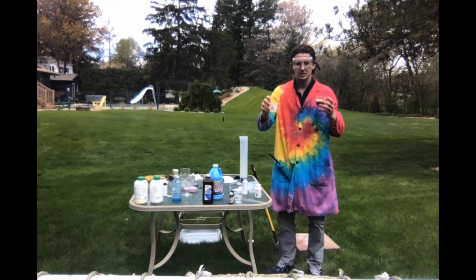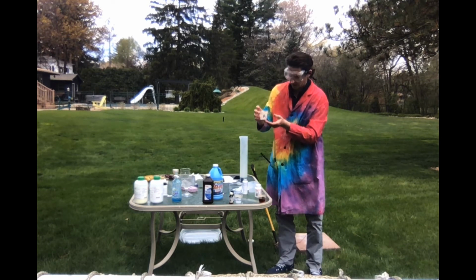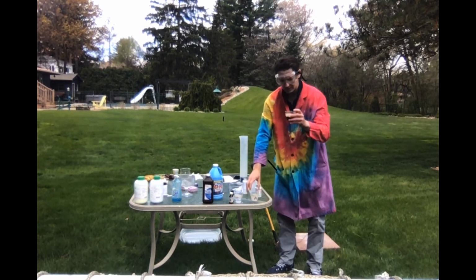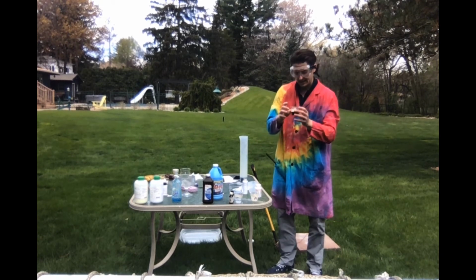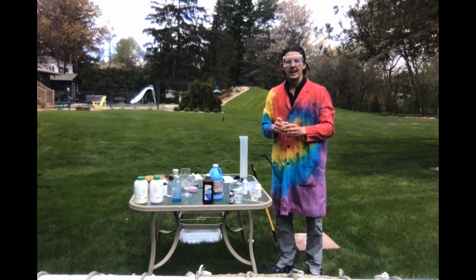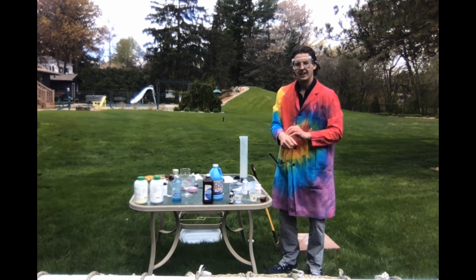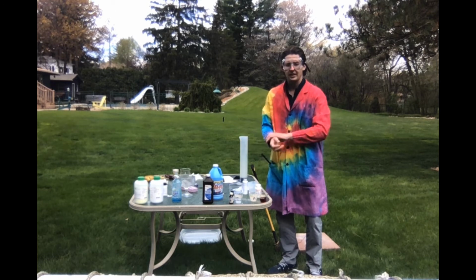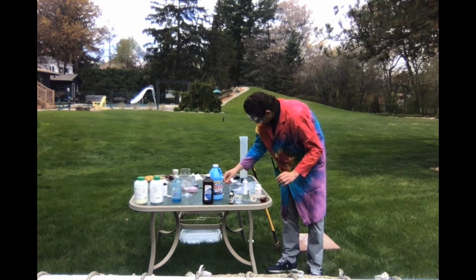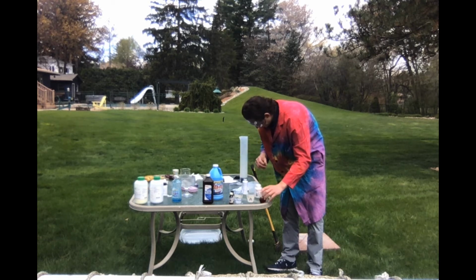So in A and B, this is what we have here. You can see A is a cloudy white color. B is more like a tannish brownish color. Iodine, who knows what iodine is used for? Yes, you. You're right, exactly. It is used in the medical field. You put iodine on cuts, and the surgeons know where to cut, and it sterilizes and cleans the area as well.